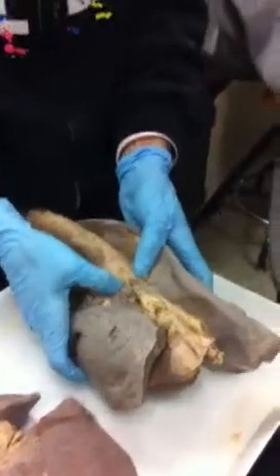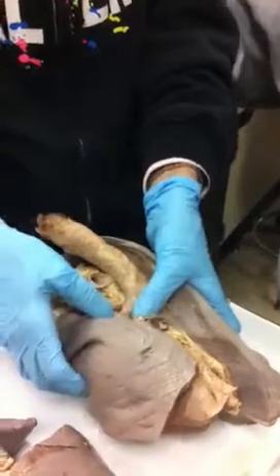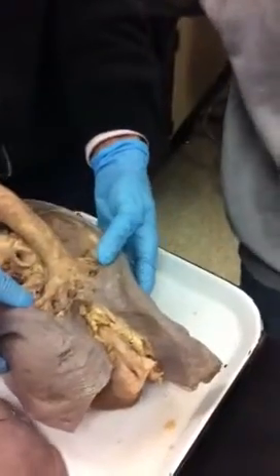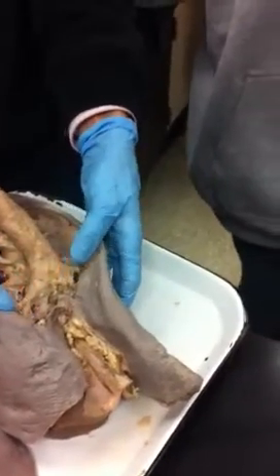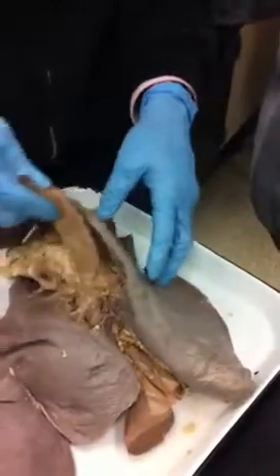Primary bronchus. Okay, right at that very first split. And then once we get in here, you see how they split again. If we went deeper, they'd split again. These are the secondary bronchi in here. So the first V up here is primary. The second V's down here are the secondary. And then they just keep splitting into smaller and smaller tubes. That's really all you need to look at on this thing.